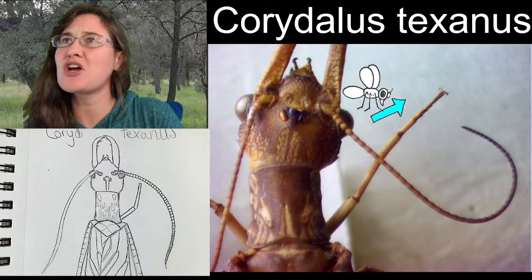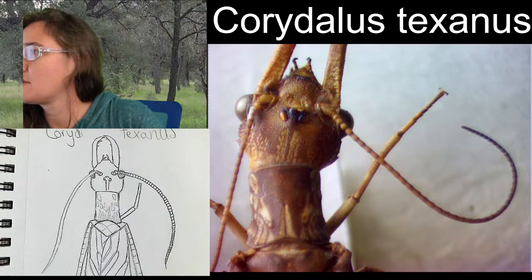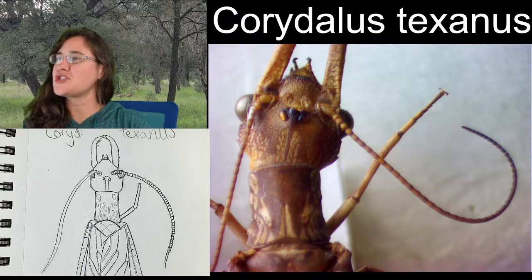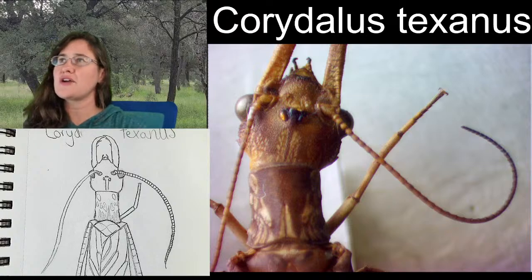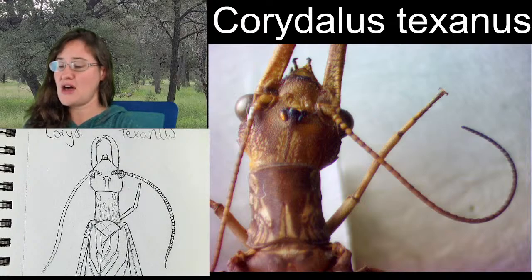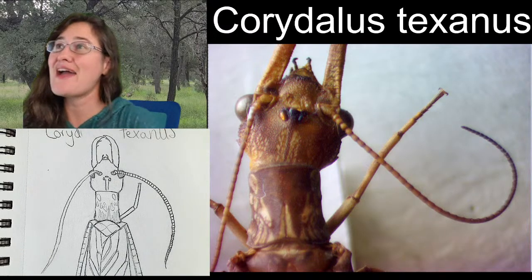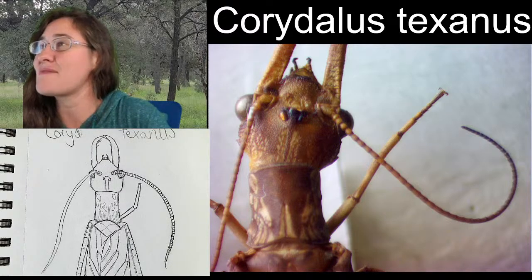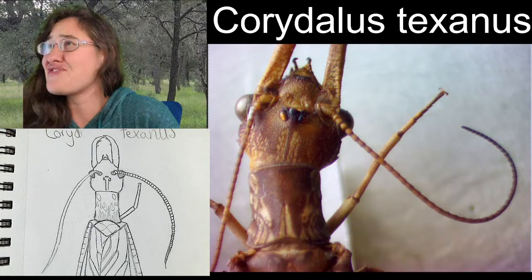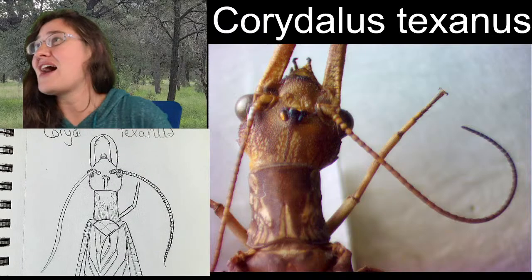Did I say 5 tarsal segments when we were zoomed in? You've never seen them in Washington. Are you too far north? I have not done a whole lot of collecting in Washington. I've been there, but I've not done a whole lot of collecting. So let me go ahead and look up your state and see if you guys have them in Washington. I thought that you would, because you guys have a lot of fresh water.